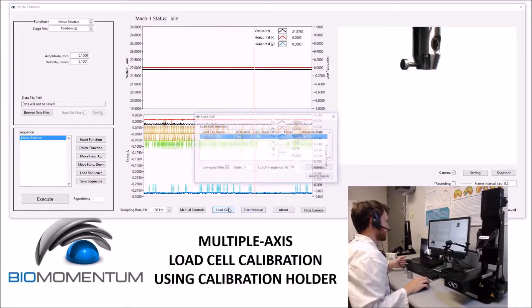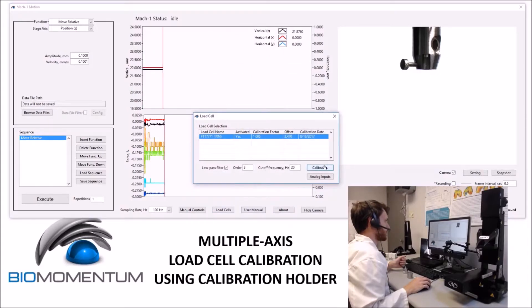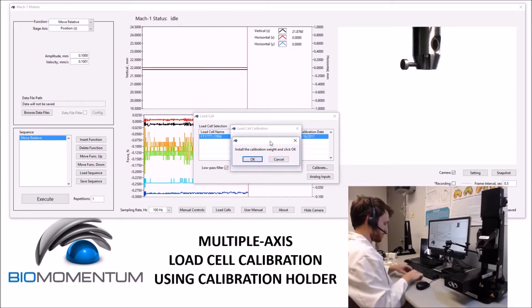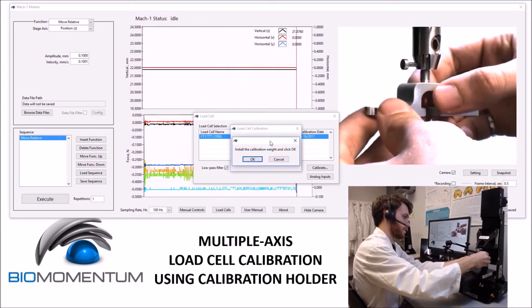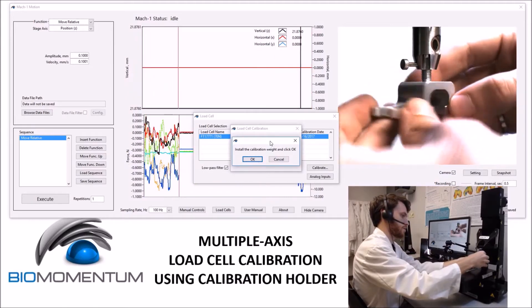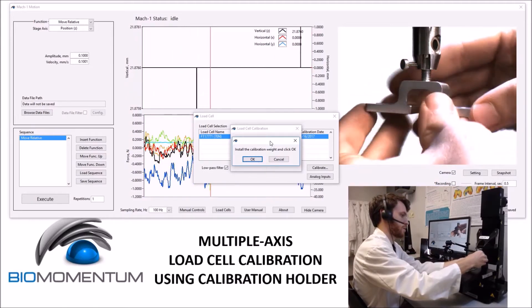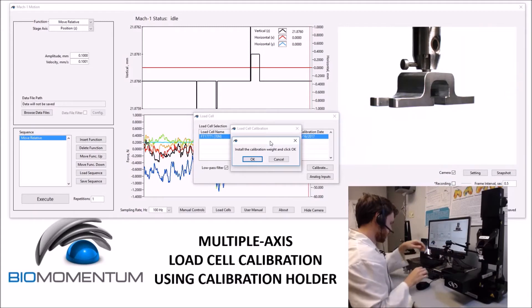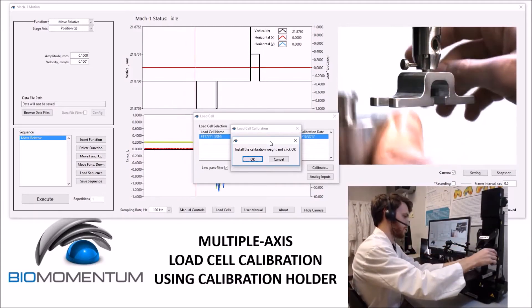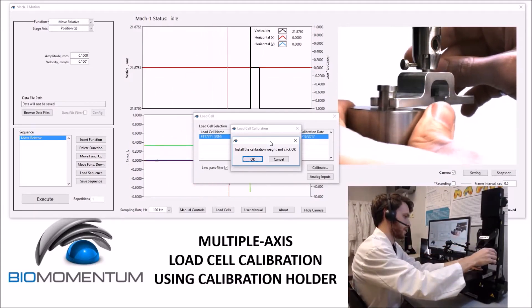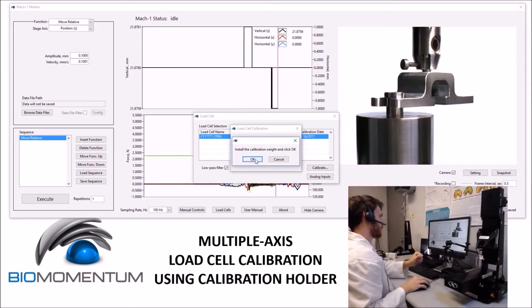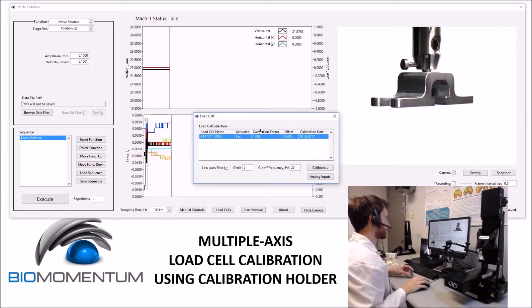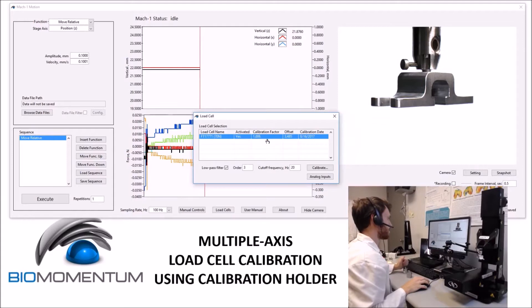To calibrate a multi-axis load cell, we'll open the load cell window, select the appropriate load cell, and then click calibrate. To start, we'll use the calibration holder and install this on the load cell. We will then install the calibration weight onto one of the sides of the calibration holder. Following the instructions on screen will give us a calibration factor within 5% of 1.00.